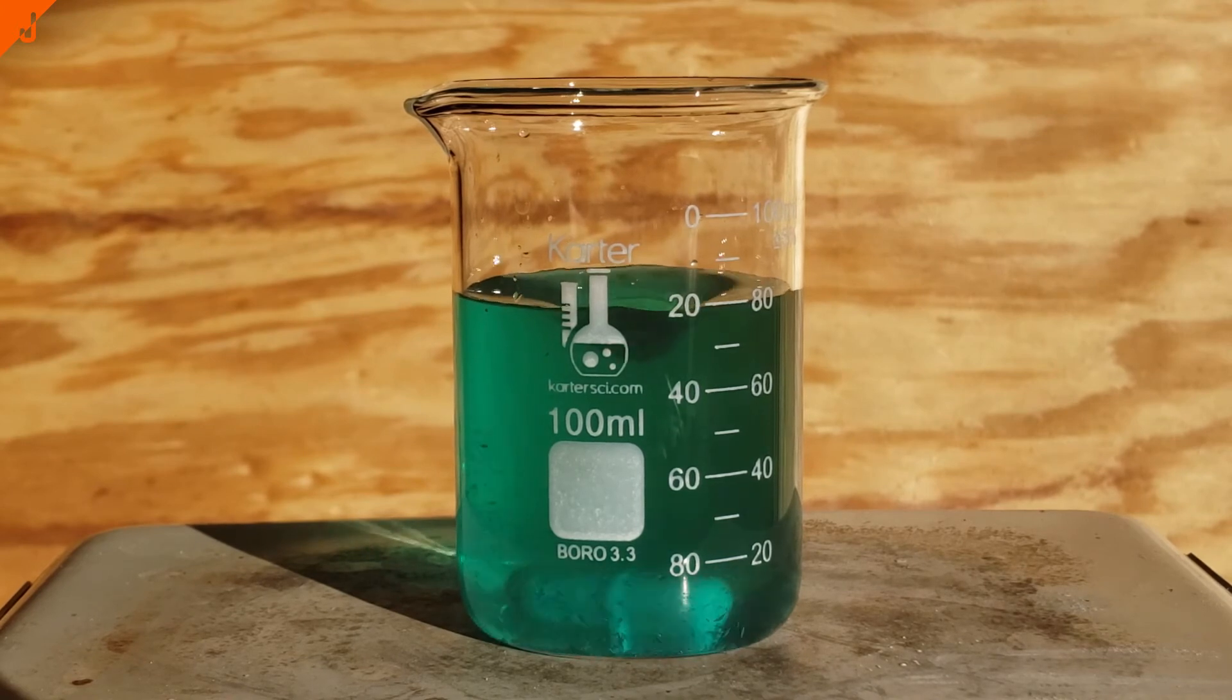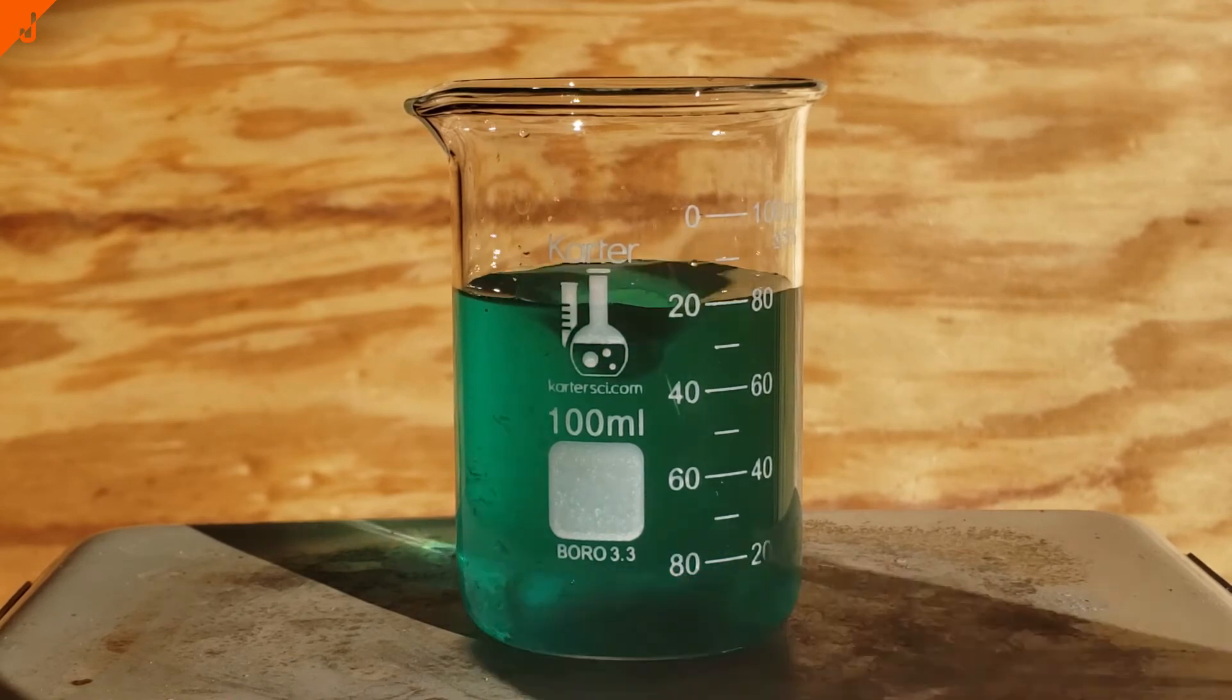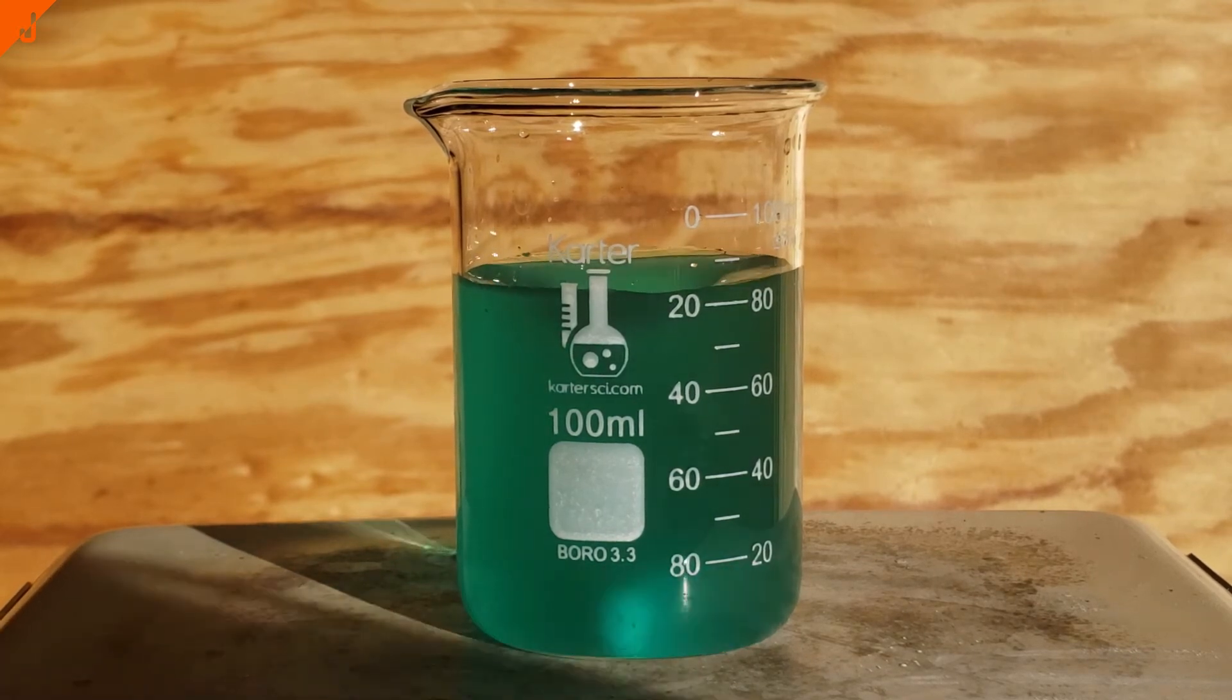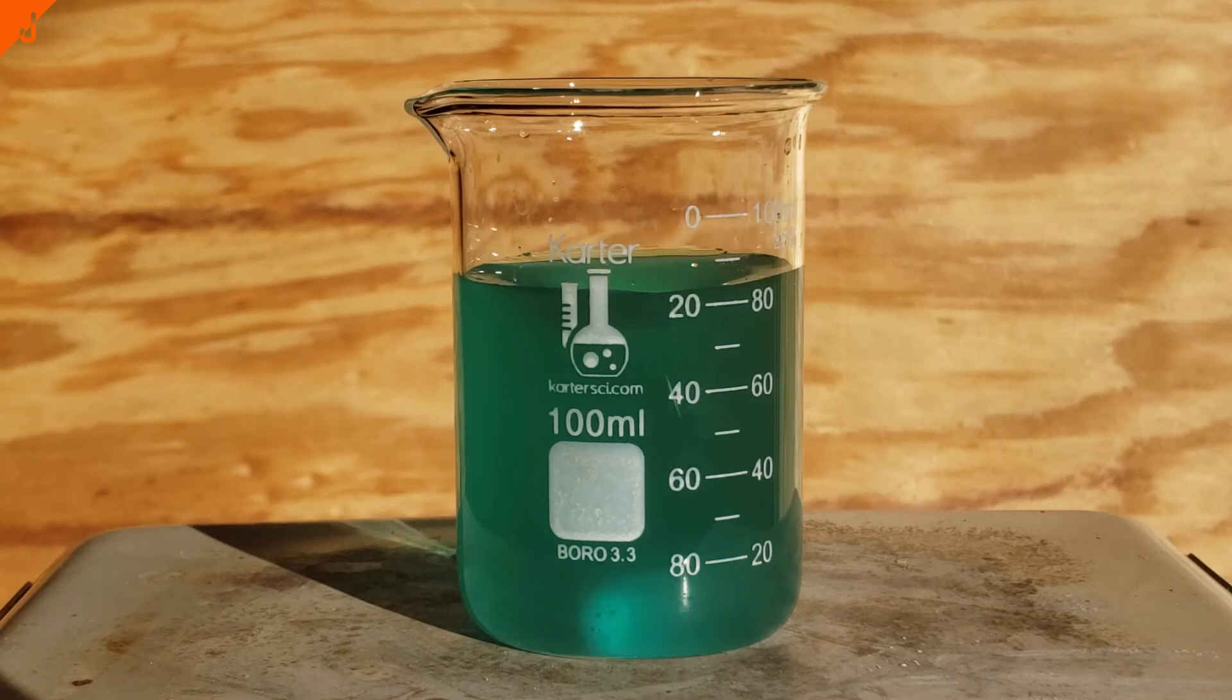As I let the solution stir for a few minutes, I noticed a precipitate began to form. From what I can tell, this precipitate is likely a mixture of different things, between potassium sulfate as a byproduct and unreacted potassium bromide or copper sulfate.